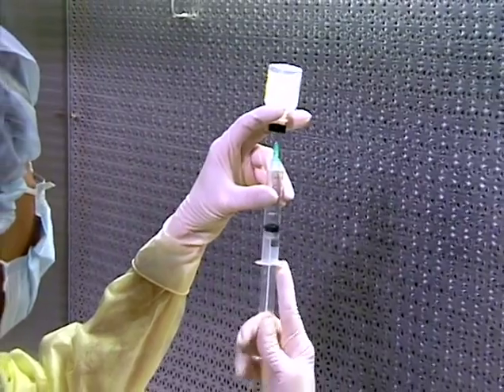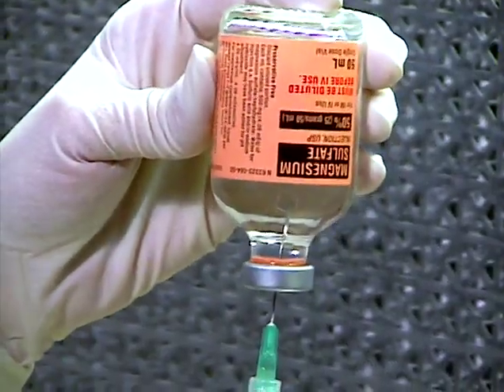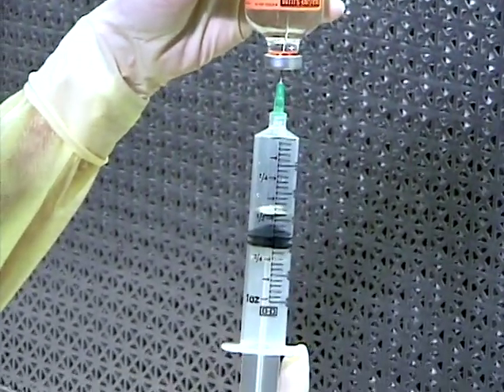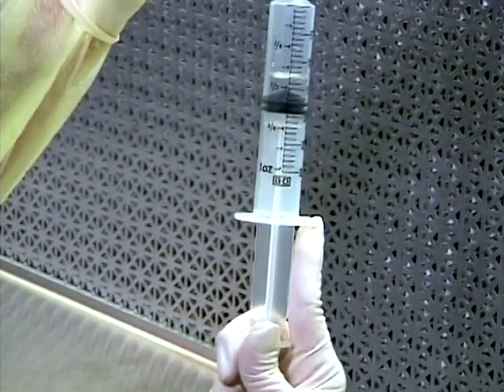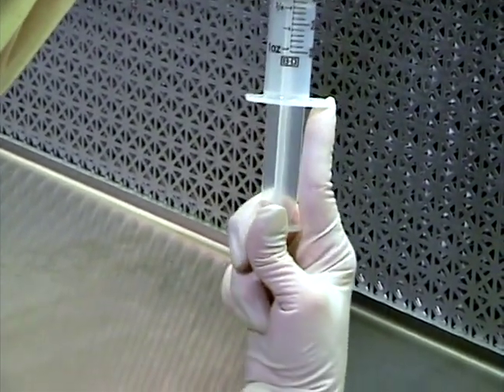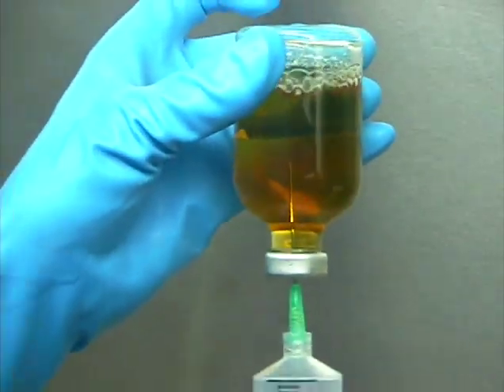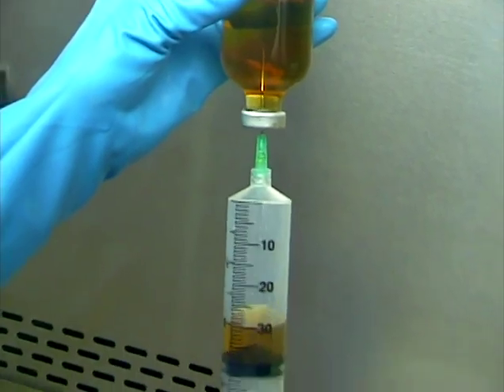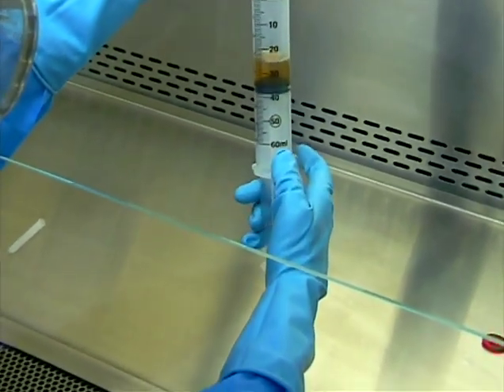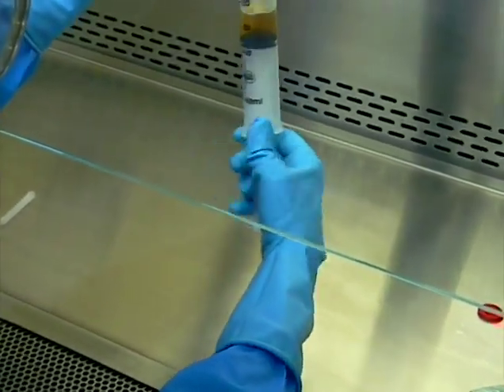For large vials, it may be necessary to grasp the inverted vial by the base and hold the syringe plunger button with the other hand, using the index finger to push against the flanges of the syringe. This technique is used to avoid palming or touching the plunger shaft. When compounding hazardous substances, the added control achieved by grasping the distal portion of the plunger may be necessary for safety and to assure sterility, provided the syringes are not reused and the touched plunger is not allowed to travel into the drug-containing section of the syringe.